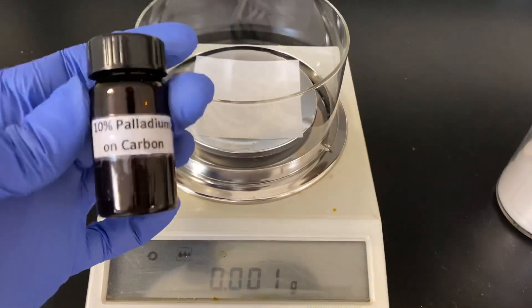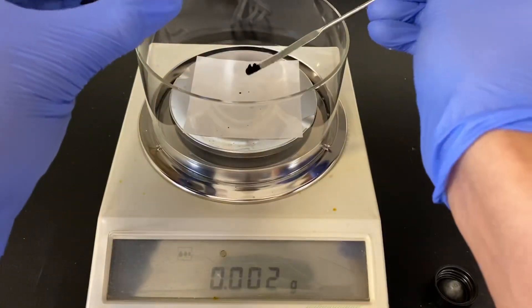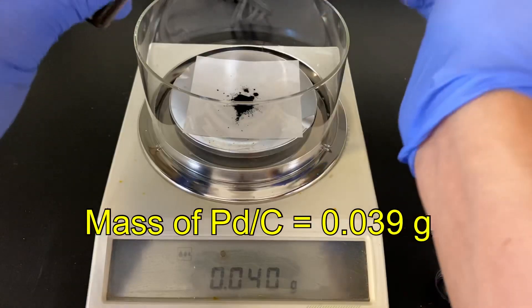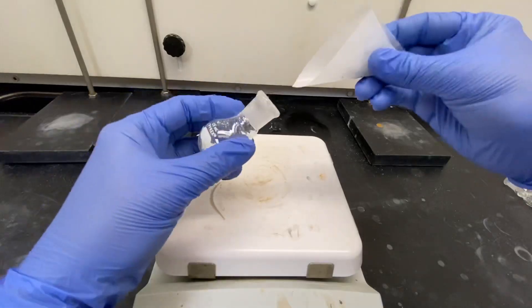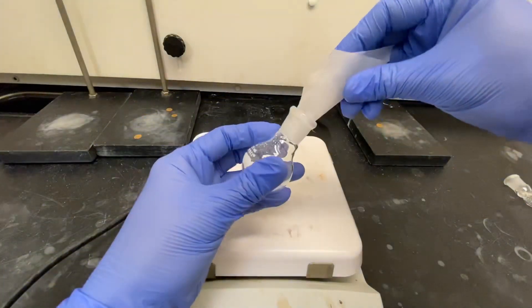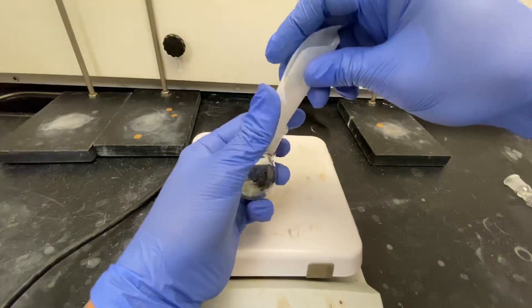The mass of the palladium on carbon used was 0.039 grams. Transfer the catalyst into the mixture and swirl to coat the reactants with the catalyst.